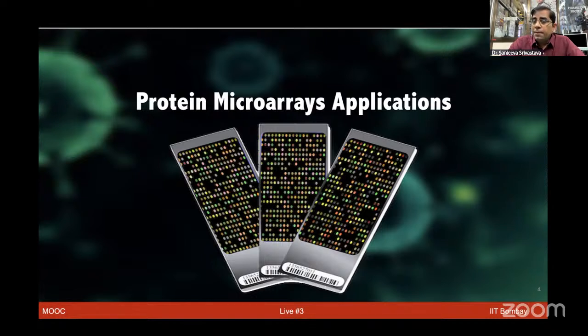And therefore, for the biomarker discovery or looking at some of the novel targets, people prefer protein microarray as one of the platforms. Also, the amount of sample which you're going to probe on the chip, you have seen microscopic glass slides for your different bio courses.